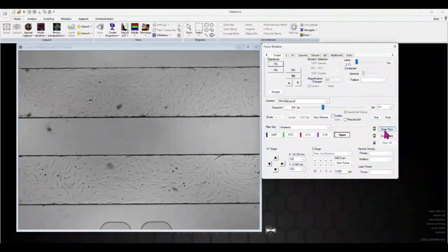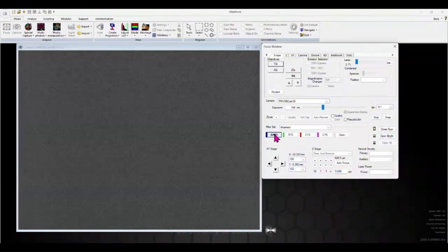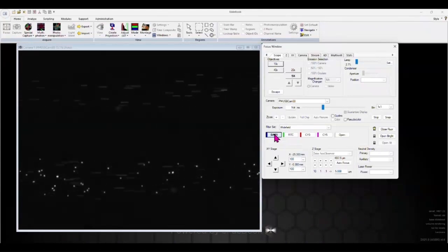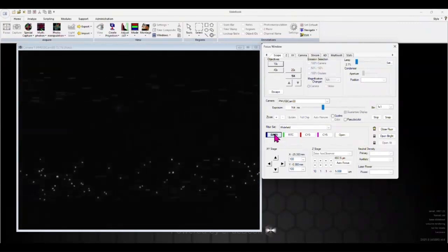Because these experiments take several minutes, I'm going to speed up the video a bit to show how Jurkat cells preferentially adhered to the inflamed endothelium on the bottom channel. When we are imaging these experiments, we normally take time-lapse images that we then use to count the Jurkat cells that have adhered to generate an object count over time with Montage Plus. I'll show you how to do this once we've gathered all our data.